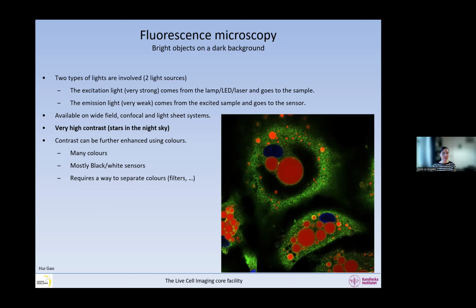So I hope that you're comfortable with all this. There are many applications, but we have a very high molecular specificity. We can use antibodies against a protein, or two antibodies against the same protein with two different conformations. So this is really high molecular specificity. We have a high resolution. There's no such thing as the precipitate that happens with colored dyes.